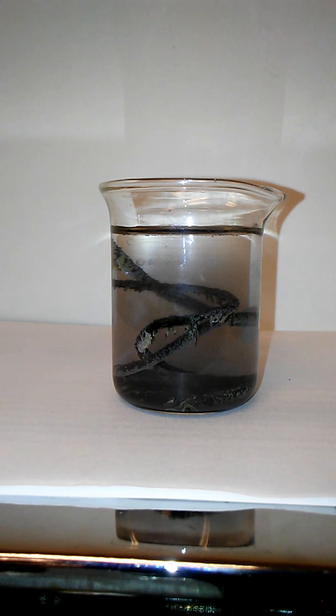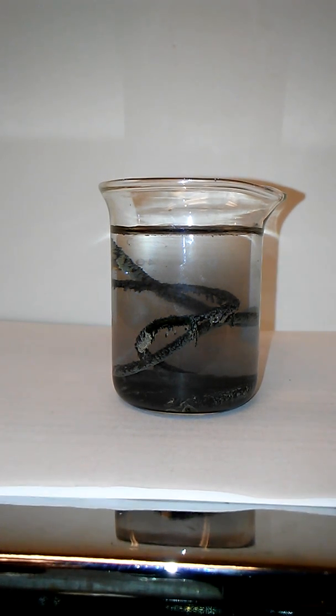It's part of what makes this solution as expensive as it is. It's about $50 for this bottle. And it's part of why, when it's done, I won't dump it. The silver isn't actually worth all that much. But it's expensive to waste it and to buy this again, and so what I can actually do is a reaction and dissolve everything that's in there and then extract the copper, in this case extract the iron, and then I'll have silver nitrate solution again that I can reuse in the future.